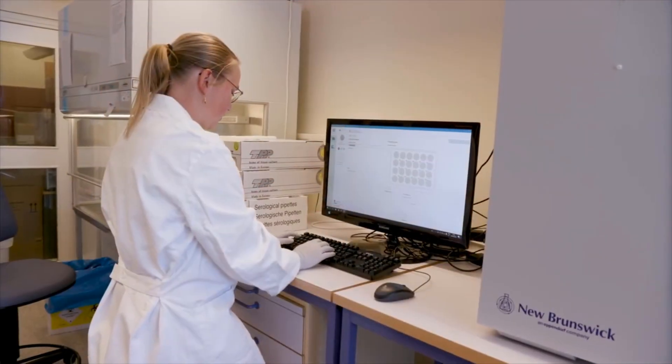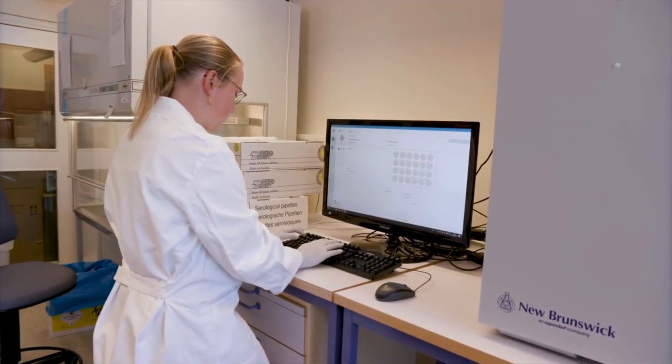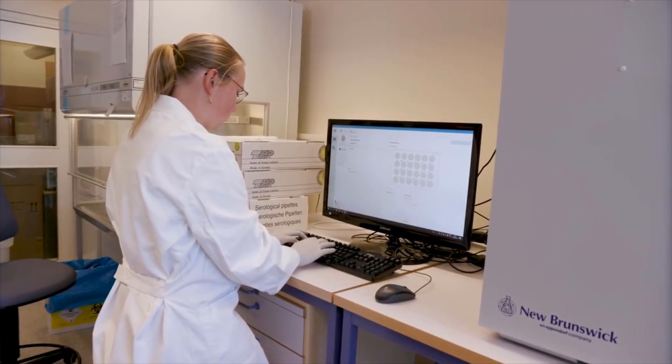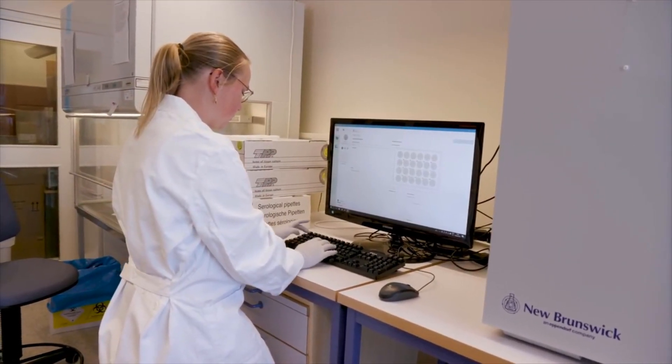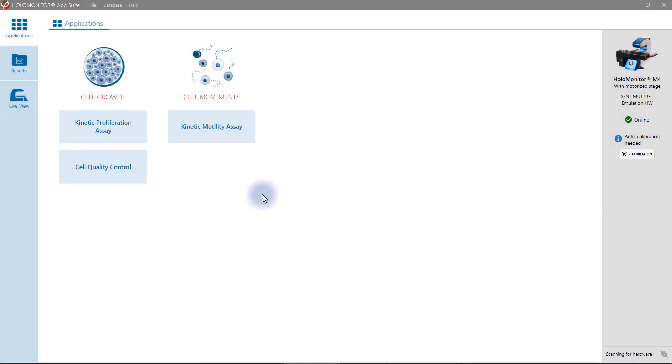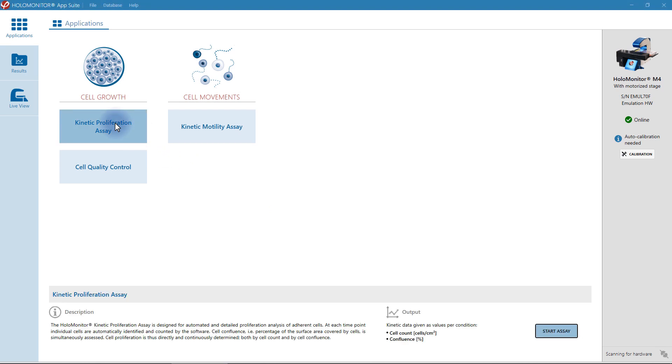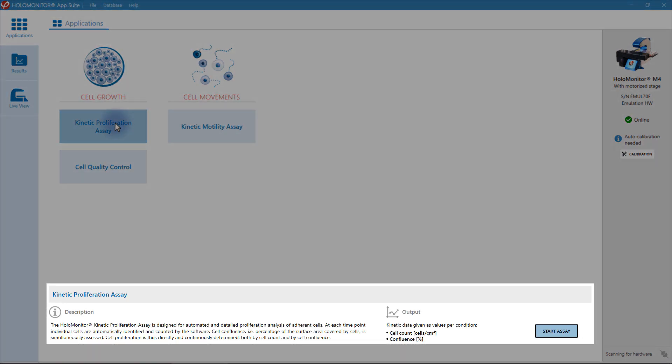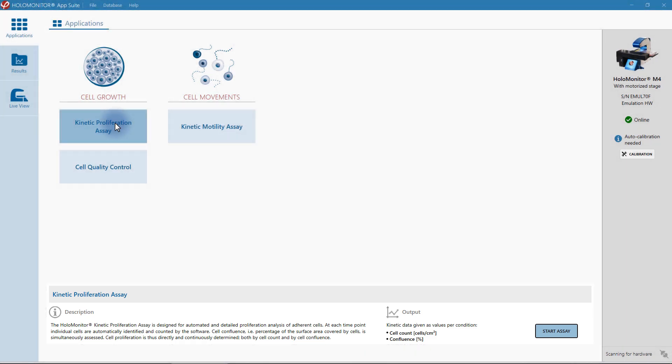Go to the AppSuite software. The guided user interface will show you how to set up your assay, step by step. First, choose your application from the main menu. An assay description and output parameters will appear, ensuring you know exactly which kind of results to expect.